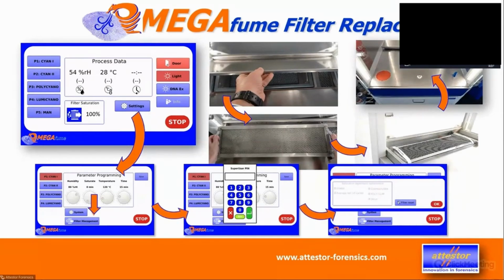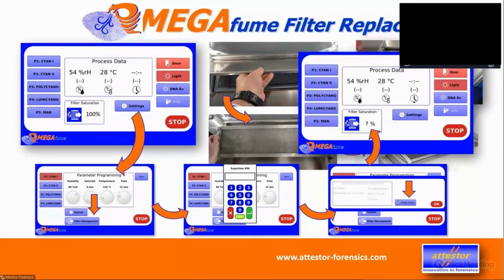And when you have your PIN, then there is a menu where you can say reset the filter and further stuff, which I will show you in a second. There's other options you can adjust, but only if you have a PIN. And then automatically the counter goes from whatever it was down to 0 again.